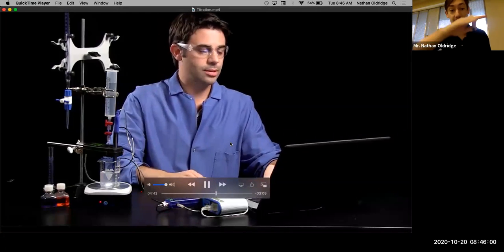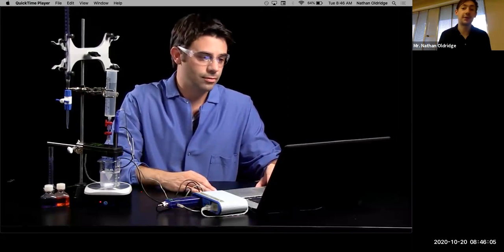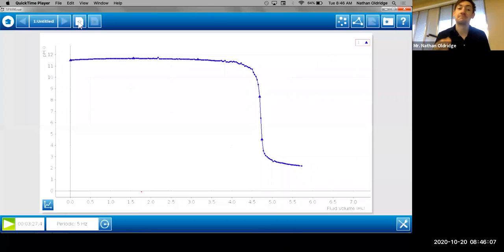He obviously started with base, started at the high pH, went almost vertical through the equivalence point, and then it flattened out because he's just becoming more acidic.